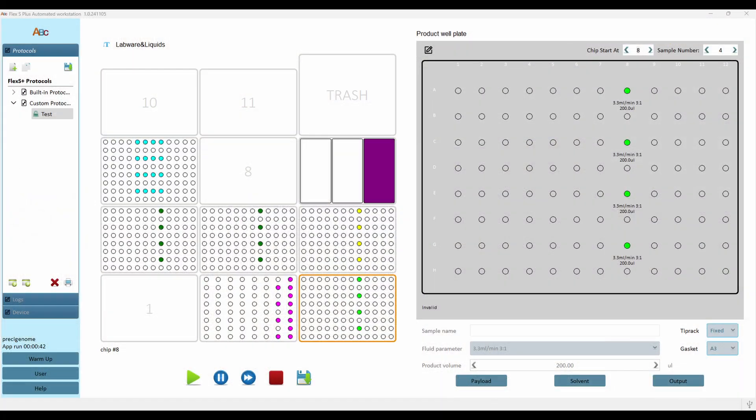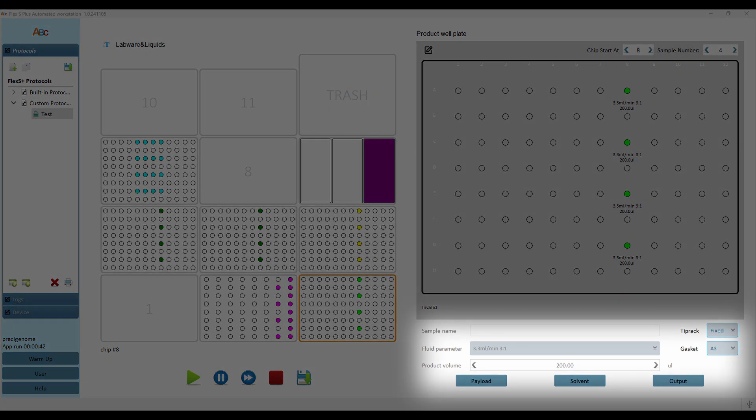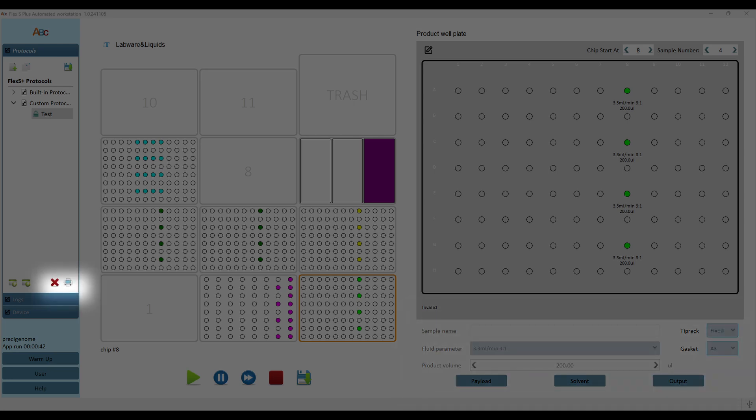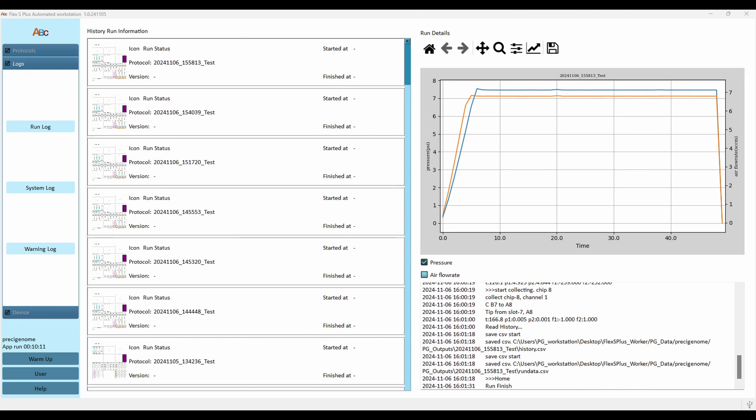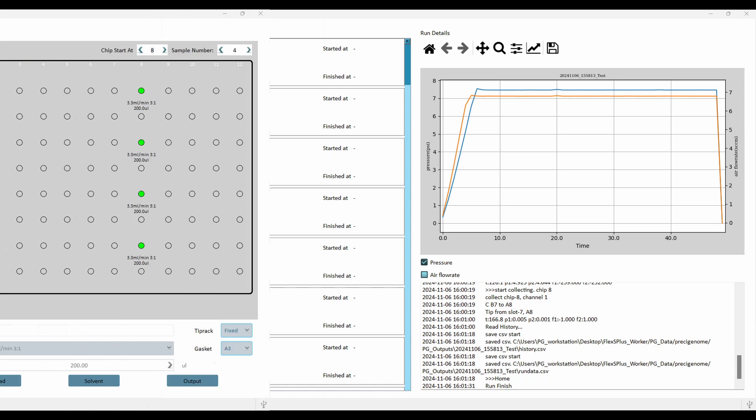The FlexS Plus' software is highly intuitive. It allows tuning of sample parameters, printing of stage layout, and review of past experimental data.